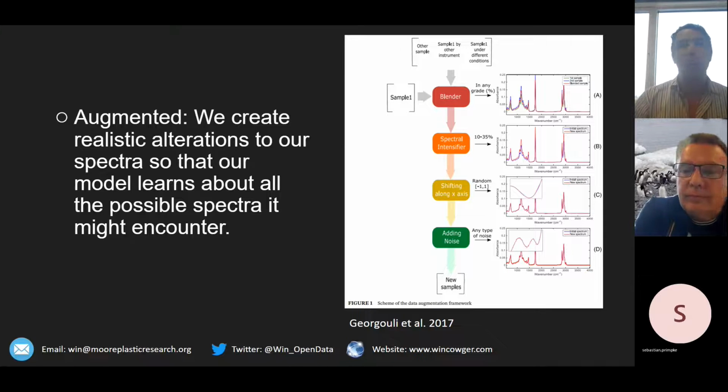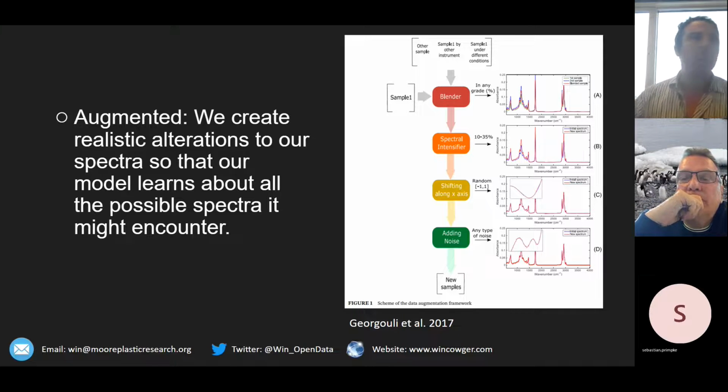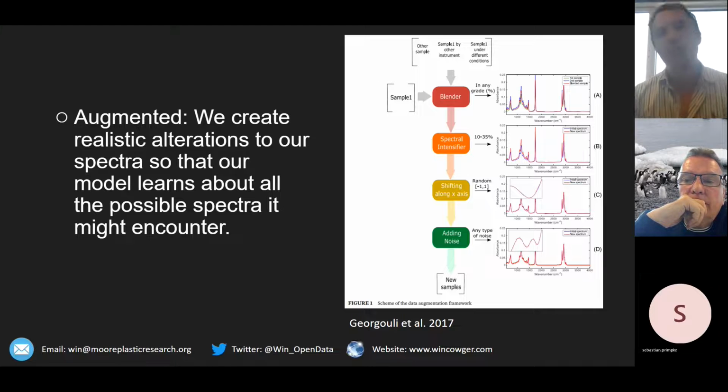So I have some collaborators who are experts in pyrolysis GCMS, and they're interested in developing a similar community database and community tool. I think it would be very different from the current Open Specy interface, but likely a lot of the things that we've developed in Open Specy could be translated into analyzing pyrolysis GCMS data. So I think it'll probably take a year or two before that really gets off the ground, just based on my experience with how long it took to get Open Specy up and going. But that's definitely something we want to do.